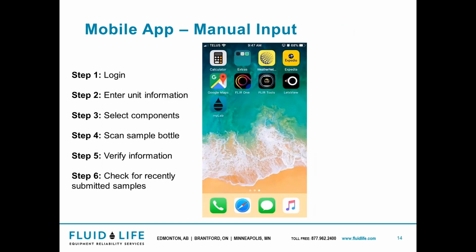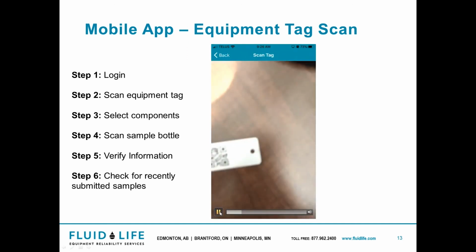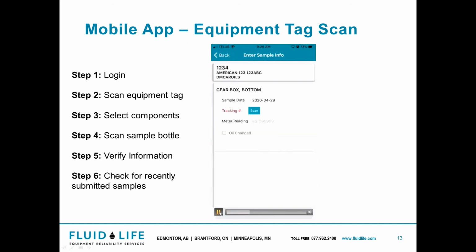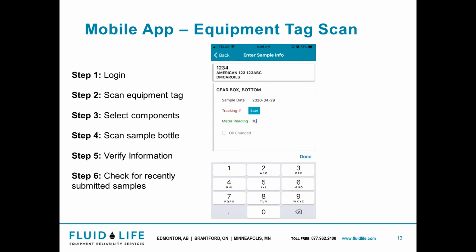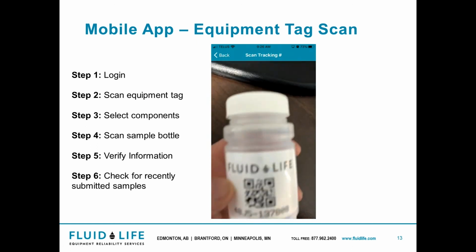Oh, sorry guys. And there, scan the bottle.